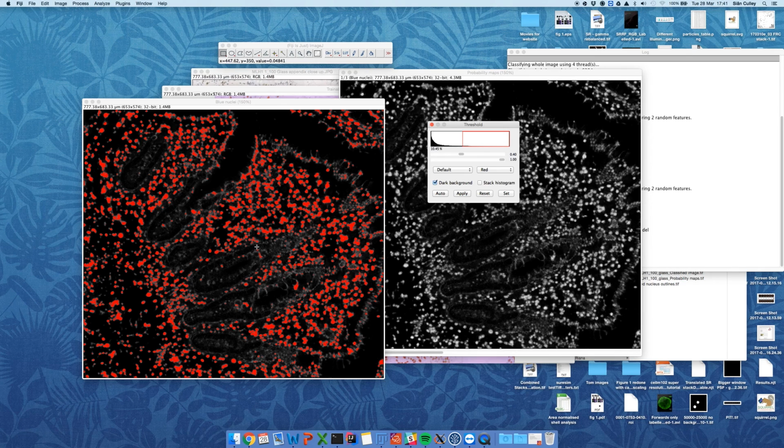So I'm going to threshold out these nuclei, maybe 10%, the top 10% of intensity in this image we're going to keep. So I'm going to press apply. Set background pixels to NaN, and NaN is not a number, it's no one's grandmother, it's just not a number. So it's not 0, it's not infinity, it's just not a number. Okay, and to the untrained eye, this has done absolutely nothing.